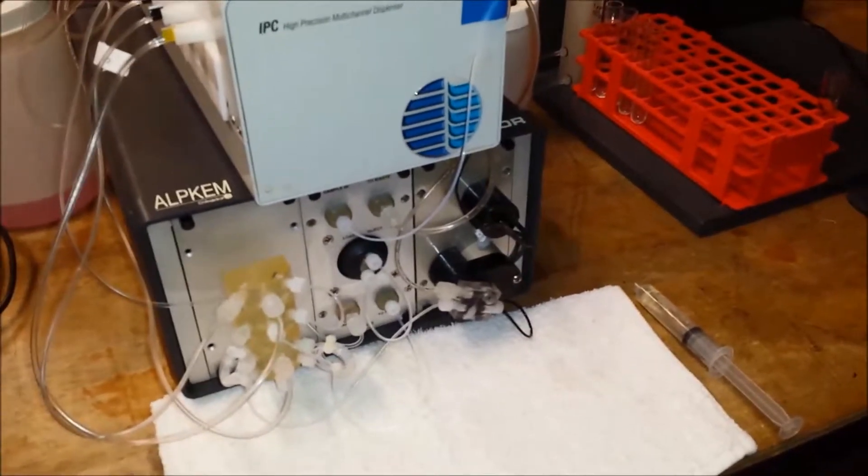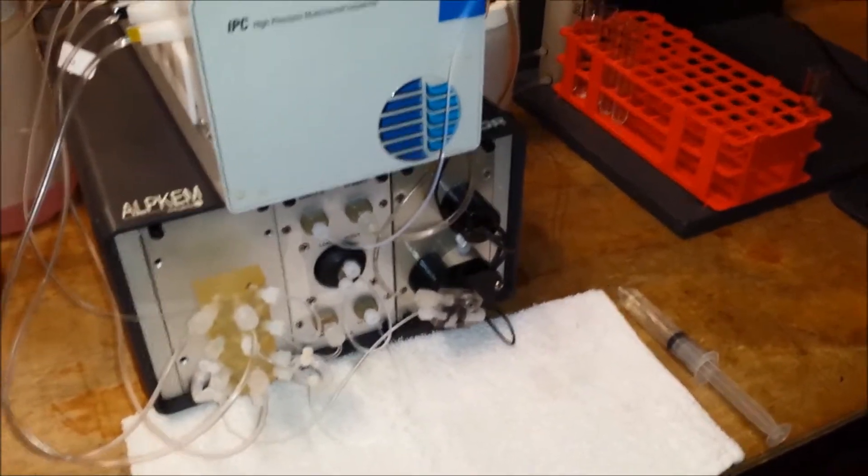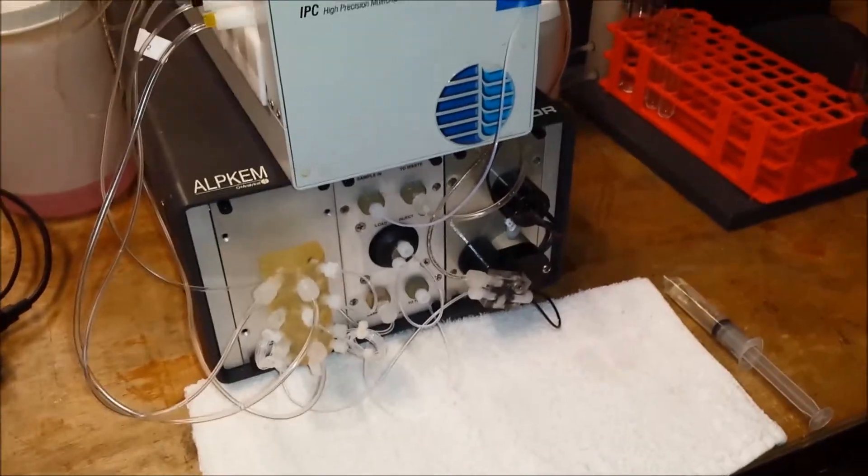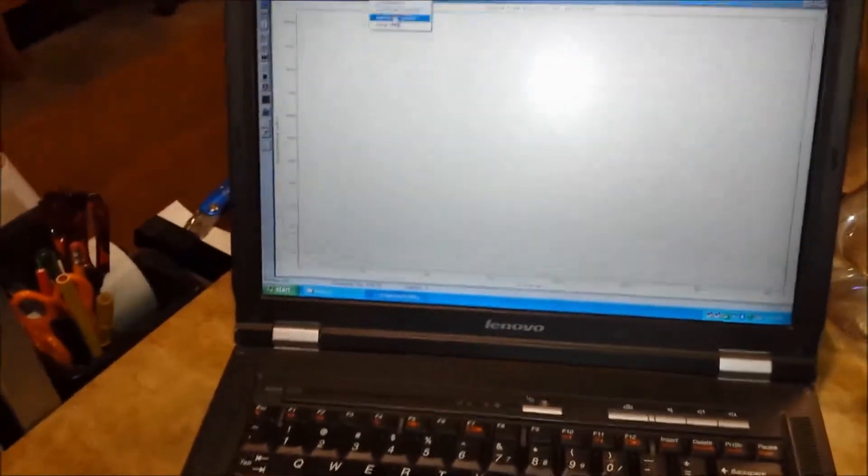When that's occurring, you have to determine whether your problem is related to chemistry or mechanical. The first thing that I always suggest people do is to look at the serial communication value and make sure that you have the proper values in there, which we do.